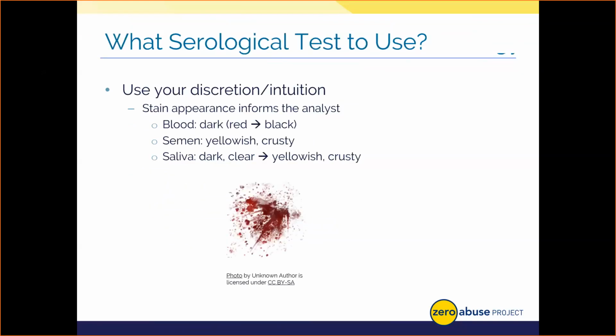At this point in the lab, I should have examined a given item extensively through visual observation, and as a result, I should have stains identified if they're present. Based on the physical appearance or ALS-based evaluation of a given stain, I'll proceed with the most logical test for that item, serologically speaking. In terms of unaided or non-ALS visualization, I'll have a good idea of what body fluid might be present just based on its physical appearance. For example, blood is typically dark red to brown or black. If I see that stain, I'm going to use my intuitive process to then take that stain and analyze it using blood-based serological testing measures.